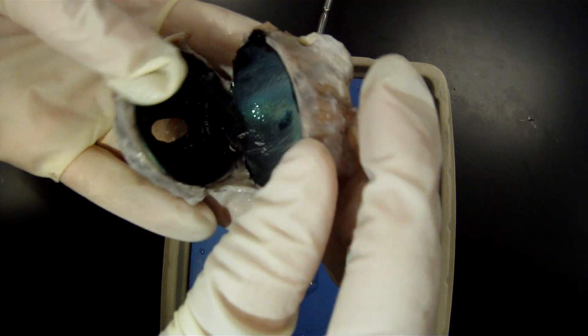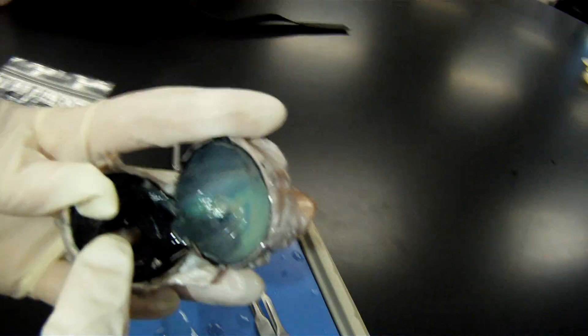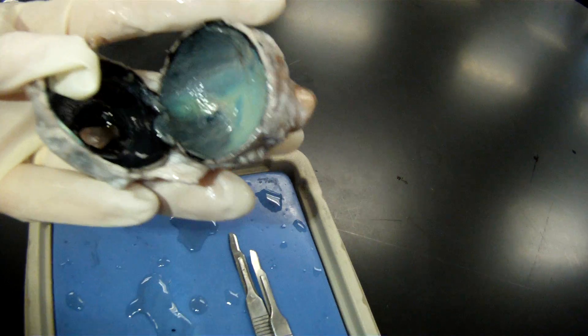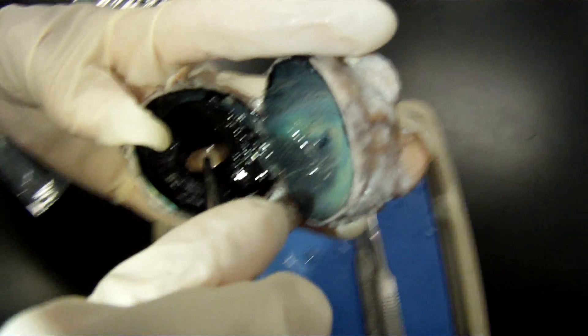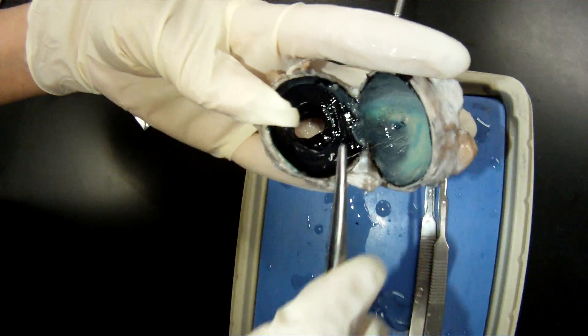Making a coronal incision, exposing the interior of the eye, the anterior chamber and posterior chamber. Anterior chamber is in there.